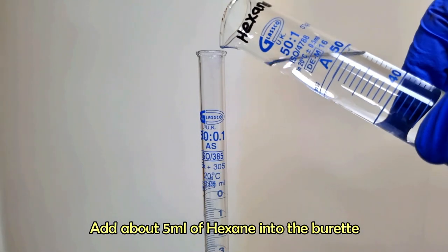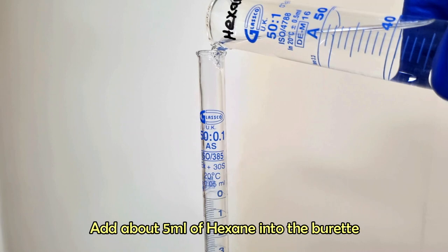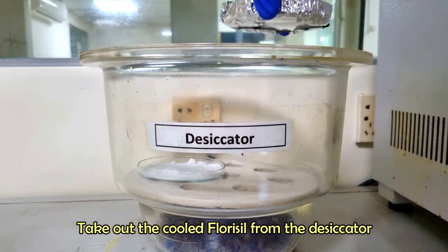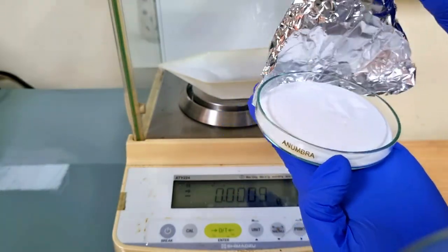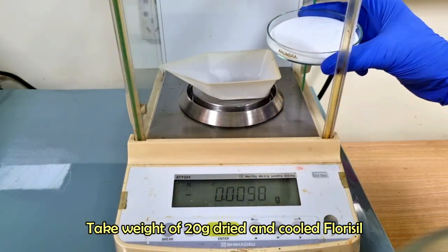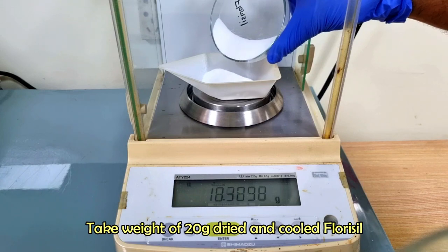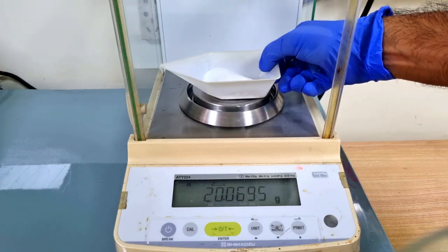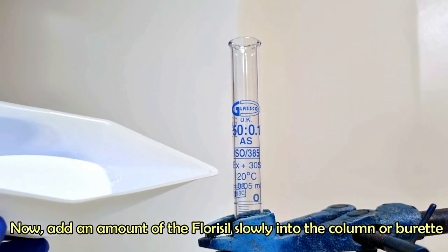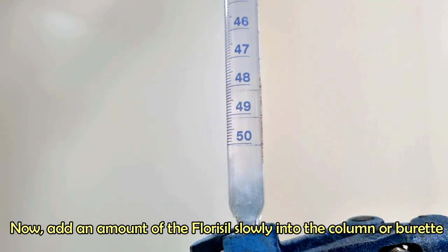Now fix the burette with a stand. Add about 5 ml hexane into the burette. Take weight of 20 grams dried florisil. Now, add an amount of the florisil slowly into the column or burette.